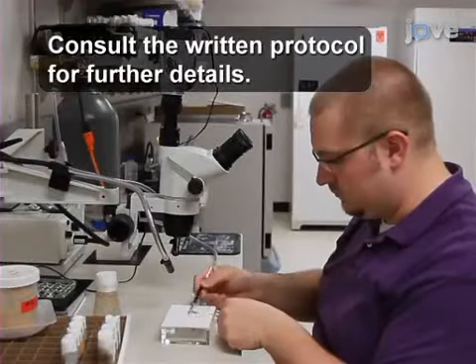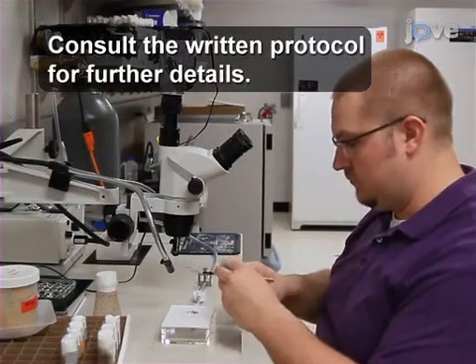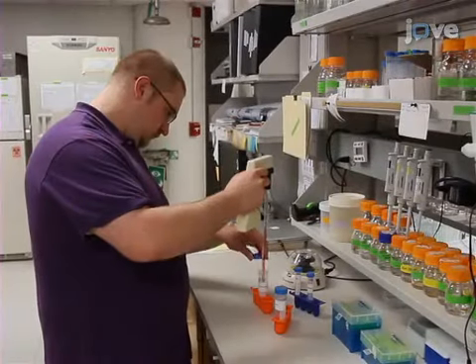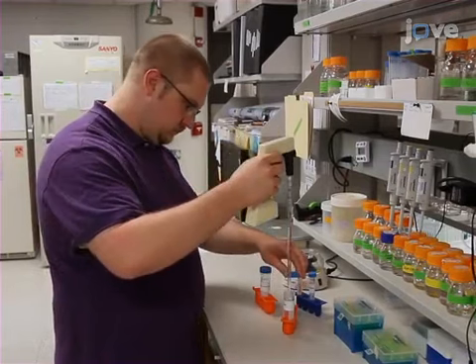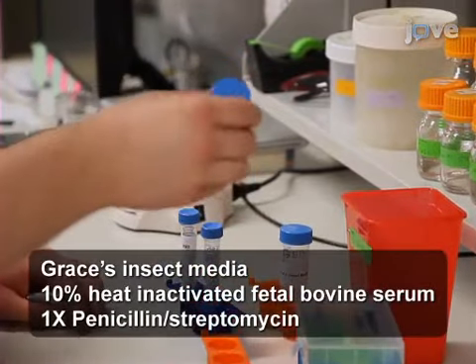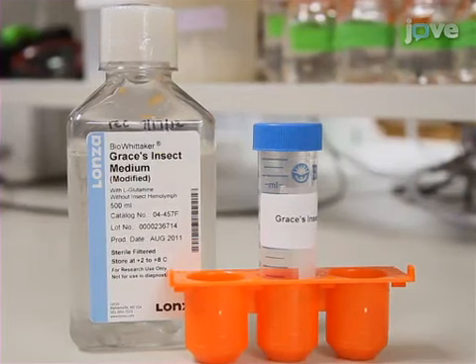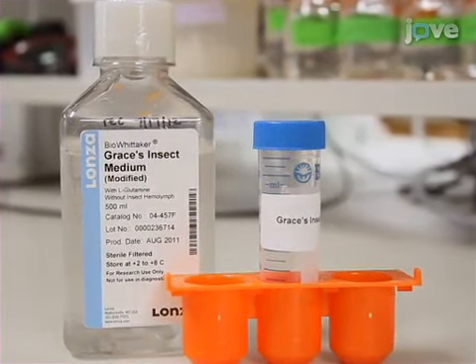For this protocol, collect well-nourished young adult flies of both sexes 2 days before isolating the follicles. If the staged follicles are going to be used for in vitro development assays, have freshly prepared IVAM media ready at room temperature. Cold media will alter cytoskeletal dynamics and development. If the staged follicles are going to be used for mRNA or protein isolation, Grace's insect media is sufficient.